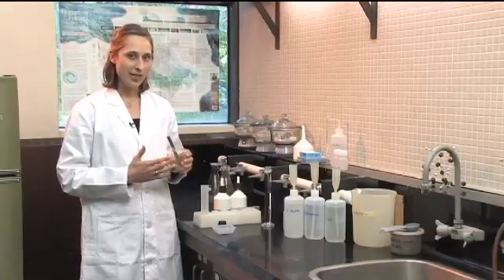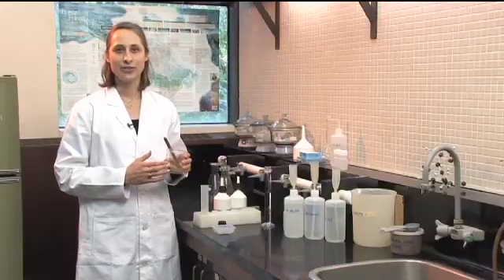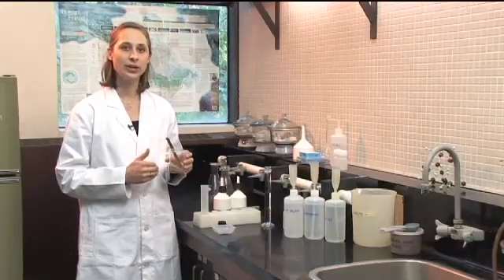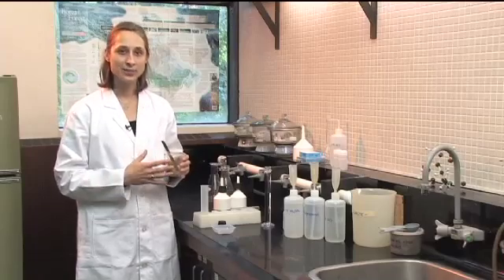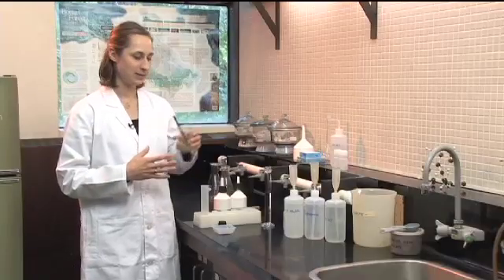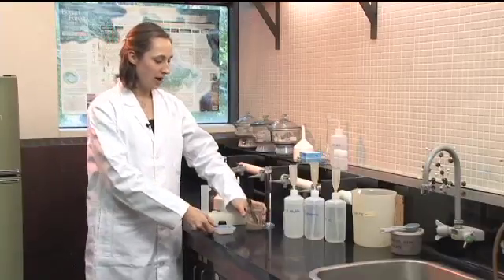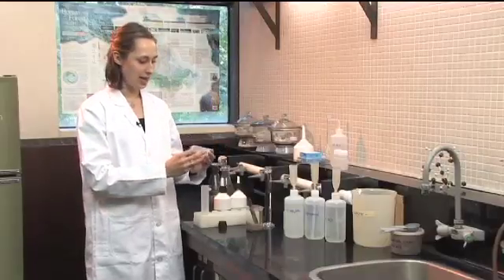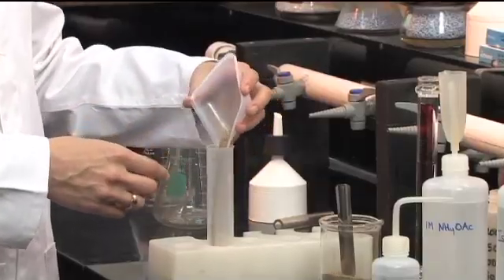The amount that we weigh is going to depend on the organic matter content of the soil. If it's a low organic matter soil, we want to use about 10 grams. If it's a high organic matter soil, about two to five grams. I've already weighed out a sample, and we're going to put that into a 100 ml centrifuge tube.